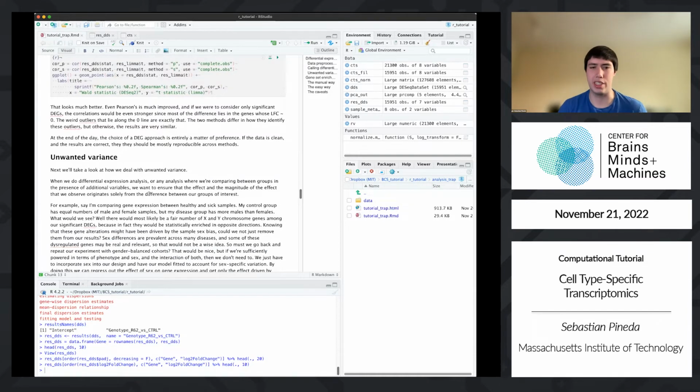Once you get your hands on the count matrix, you do some very minimal manipulations, you remove the excess genes, you normalize your counts, you stick them into a tool like this, and even doing it by hand, computing the statistics, computing the effect sizes, the p-values, is something that can be done very, very quickly, very, very easily. So this is why RNA-seq is so popular, because it's not a steep learning curve to start using it, and it's quite reliable.